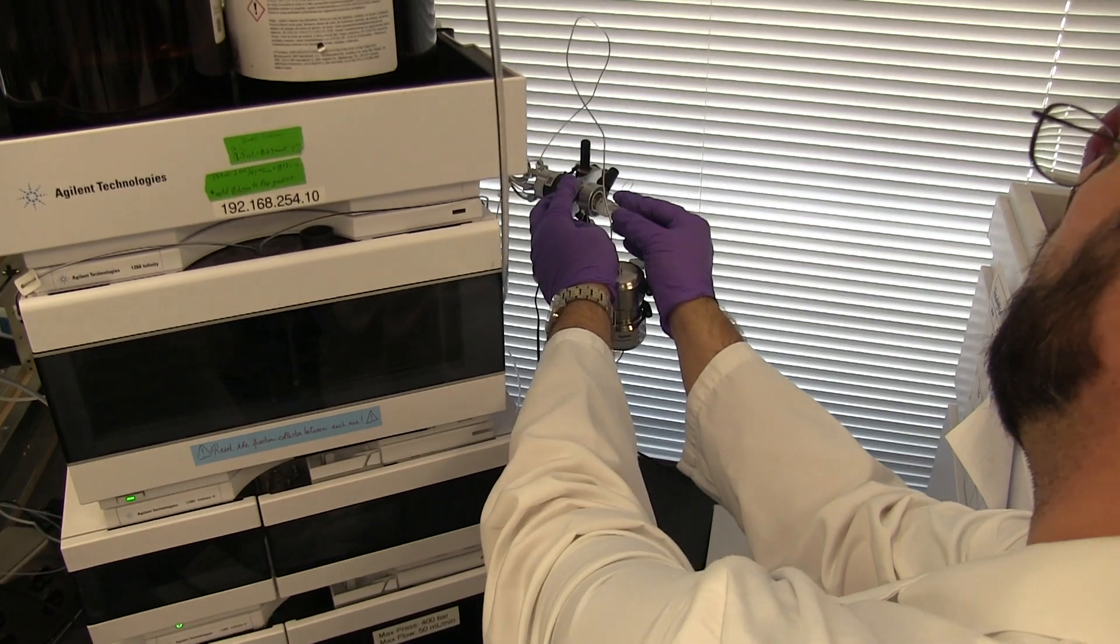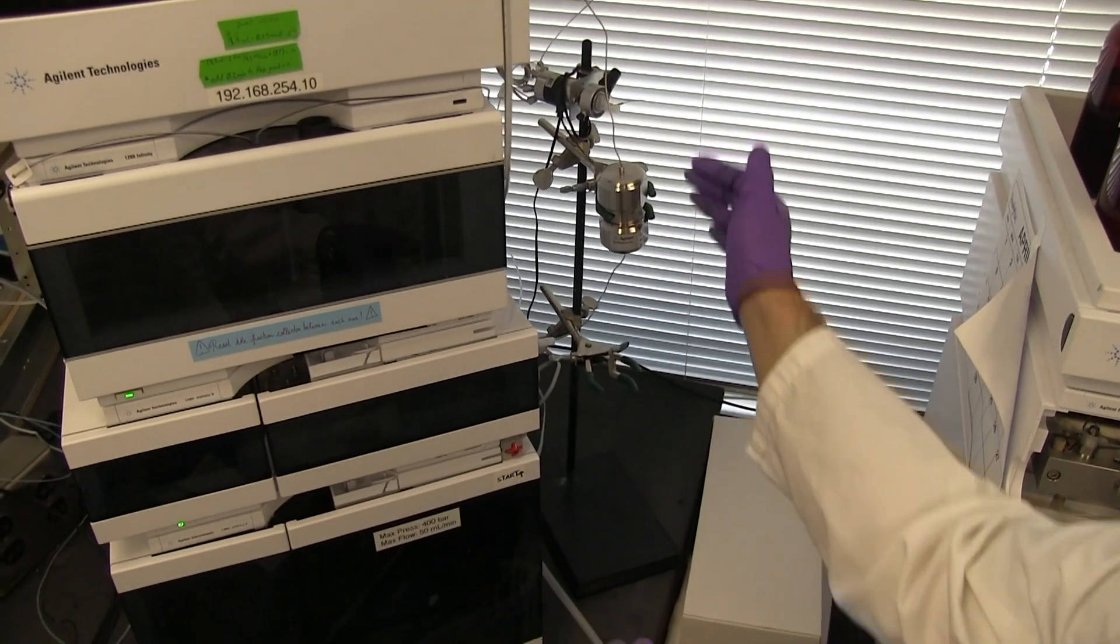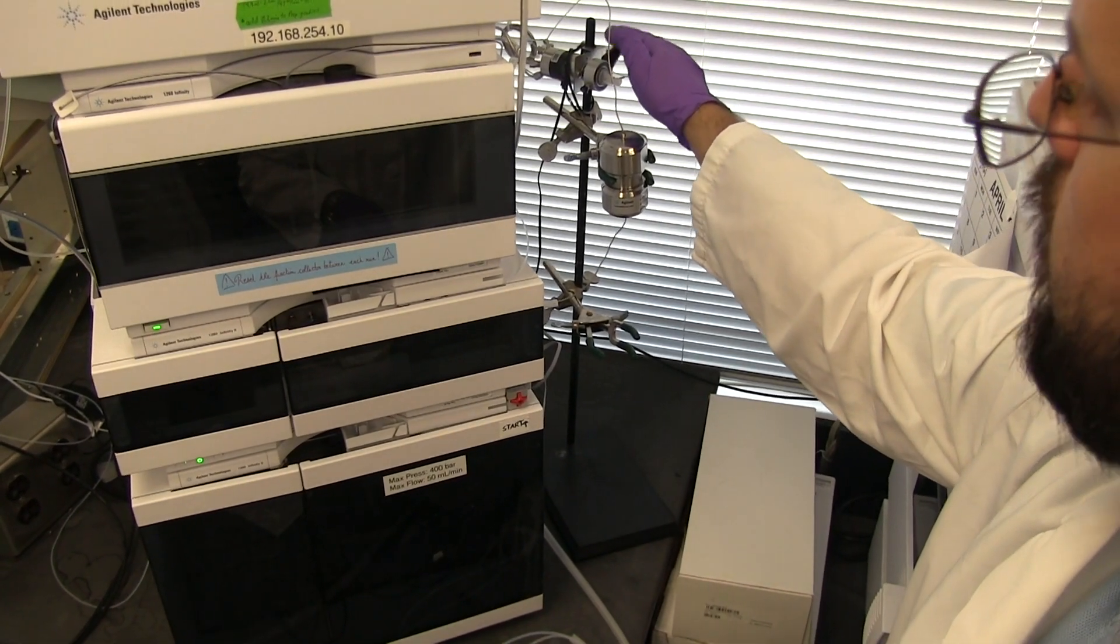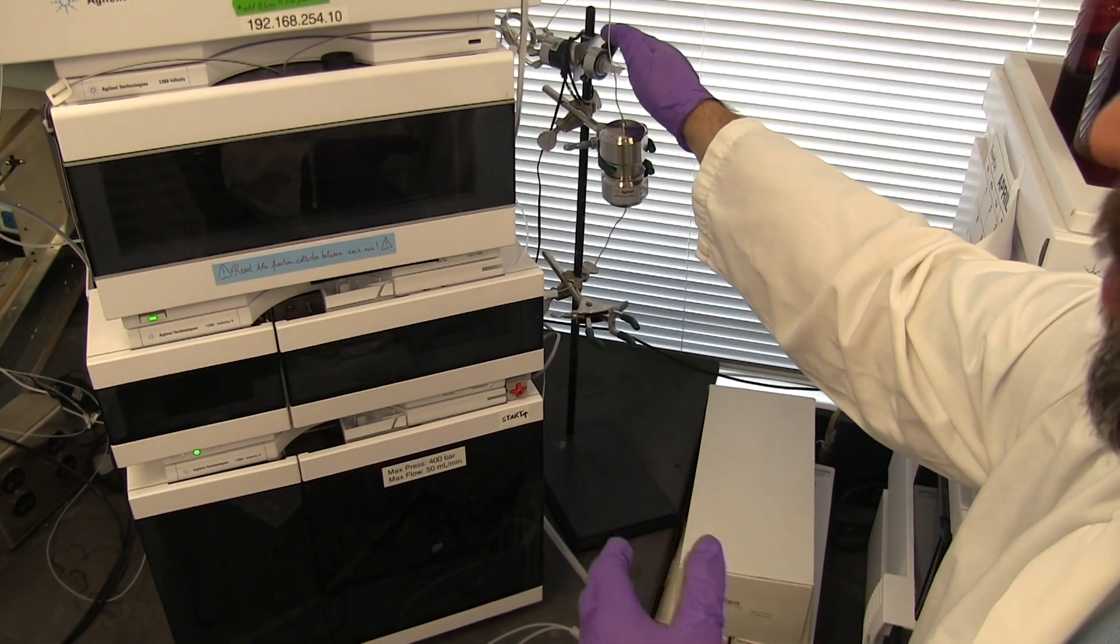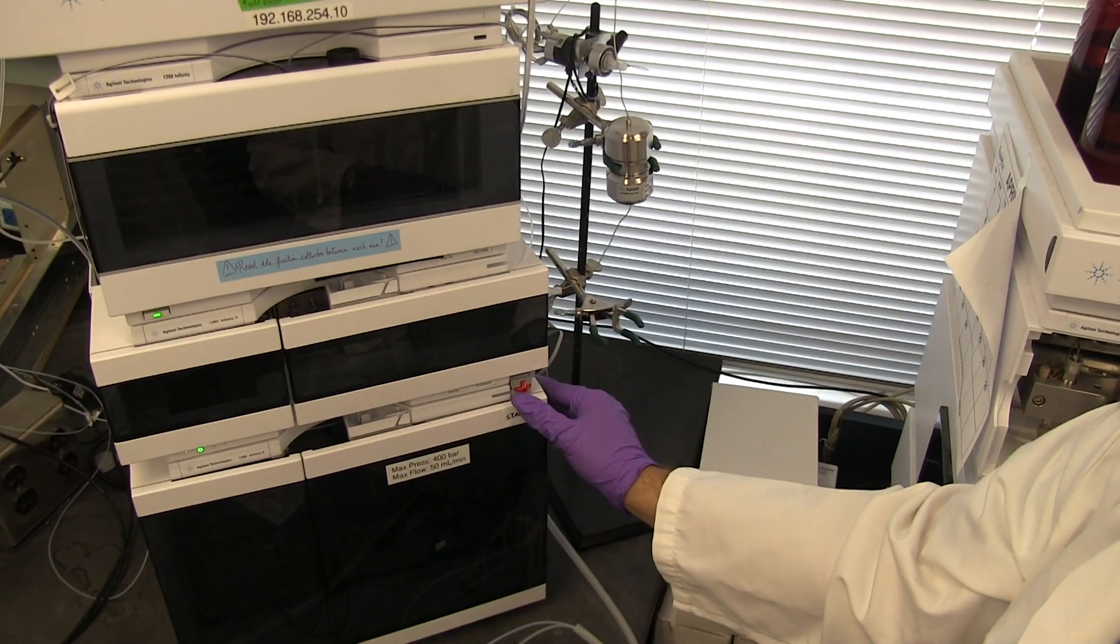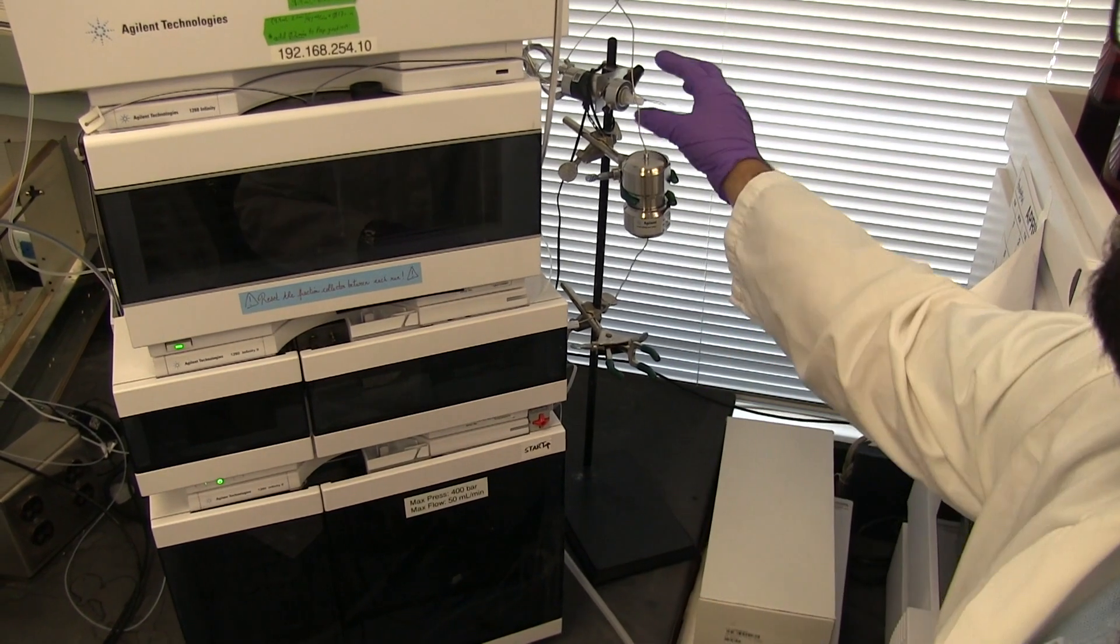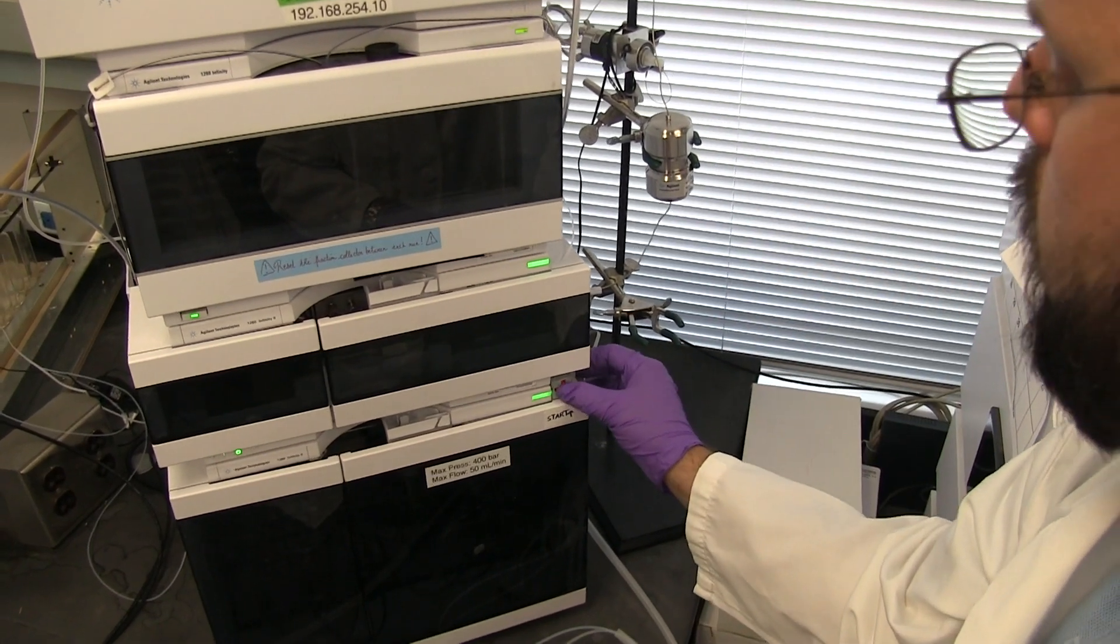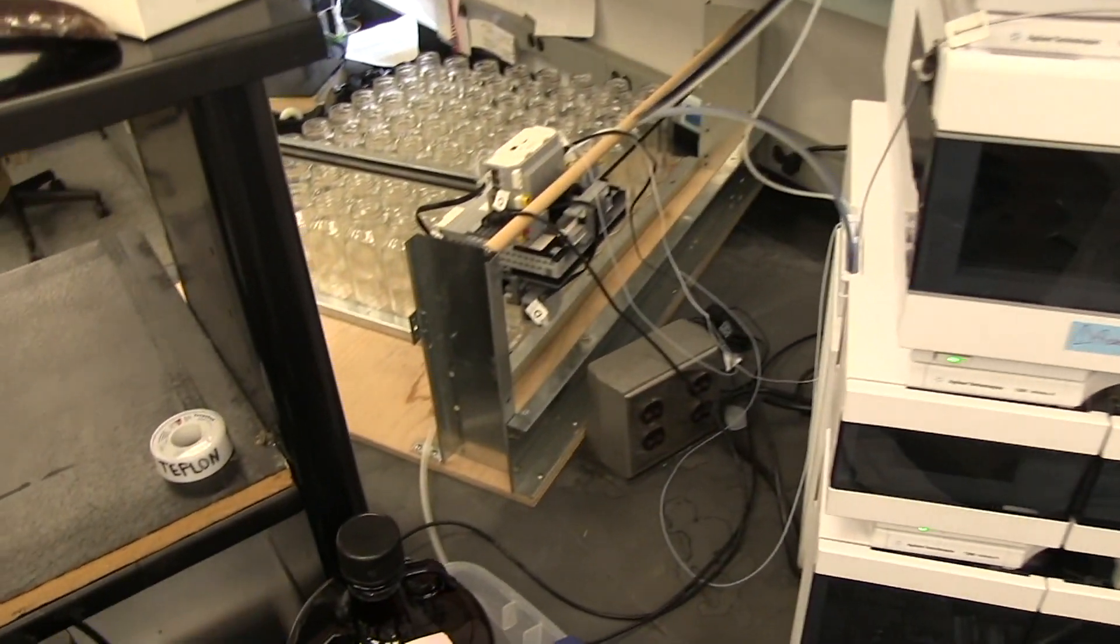The HPLC software is waiting for the manual injector to start the run so you have plenty of time for this step. And then we throw the lever from load to inject to begin the run. Then we would push the start button on the fraction collector. So flipping the lever from load to run begins the HPLC run and then we press the start button on the fraction collector.